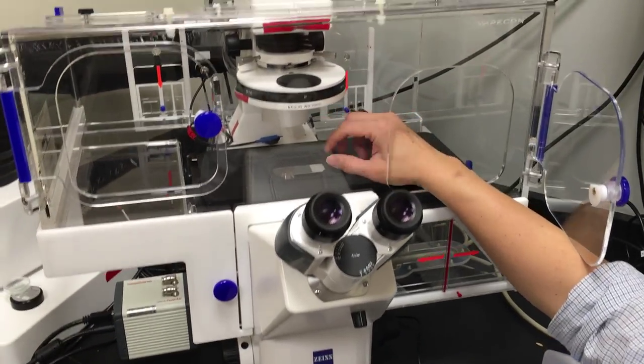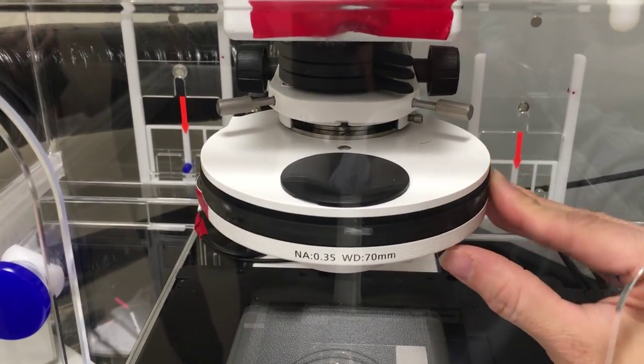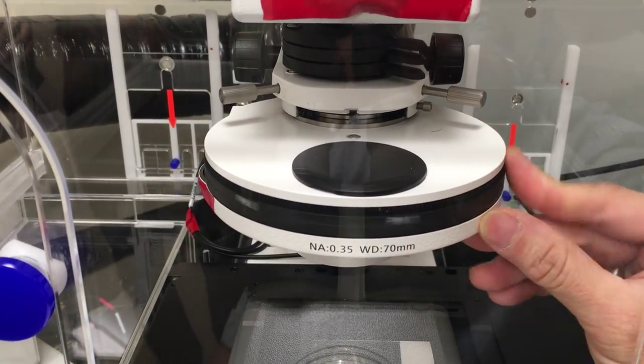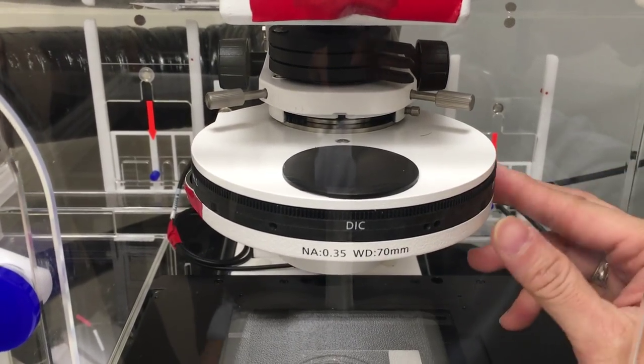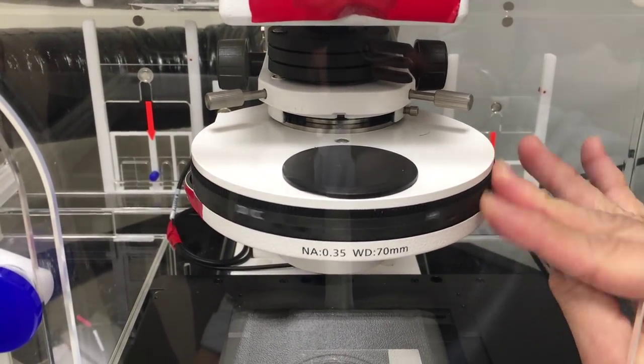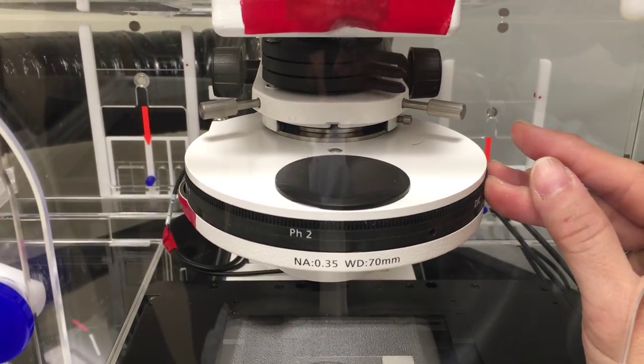The H position is bright field, meaning there are no rings in the way—just straight light coming through. Then you've got phase 0, phase 1, phase 2, and the DIC position is an empty position, back to bright field, also empty. So you've got three empty positions and three phase positions.